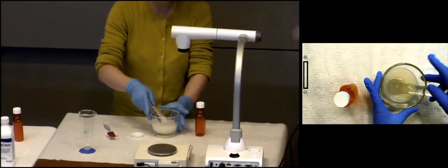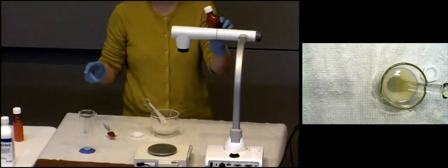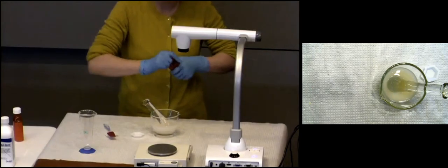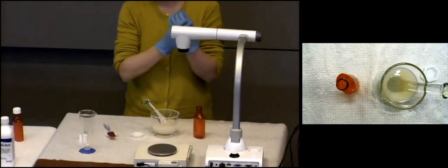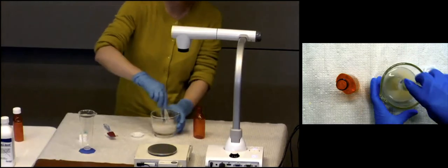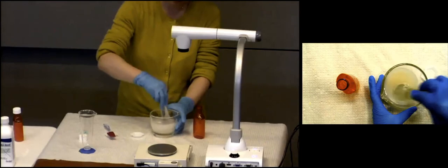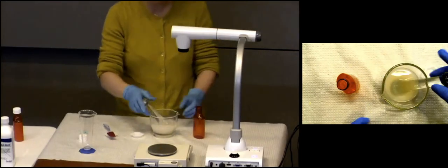Into a, what is this? A dispensing bottle won't cut it. Let's go ahead and talk about prescription bottles. Are they normally amber or are they clear? Why are they amber and not clear? Light resistance. We'll talk about the storage in a little bit. You do need to use a prescription bottle, but you're going to have to describe that, meaning that a prescription bottle means that it is light resistant. All right, so I'm ready to transfer.